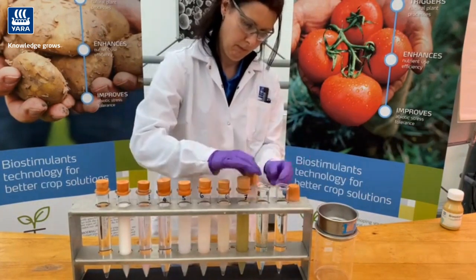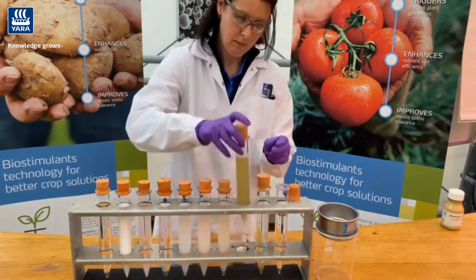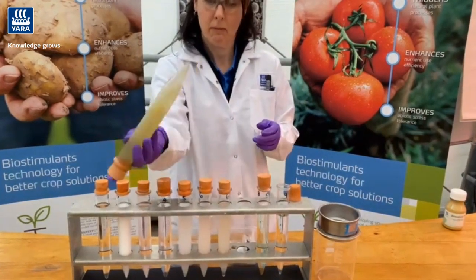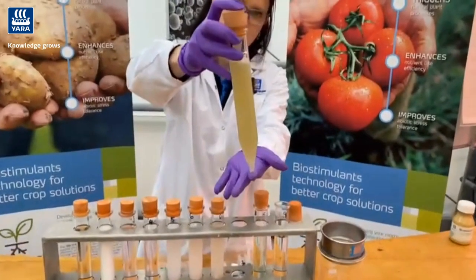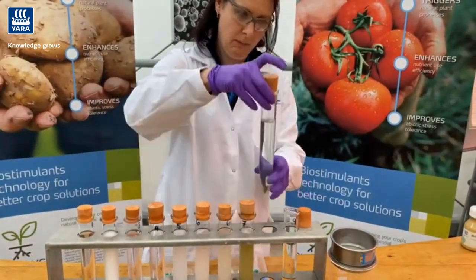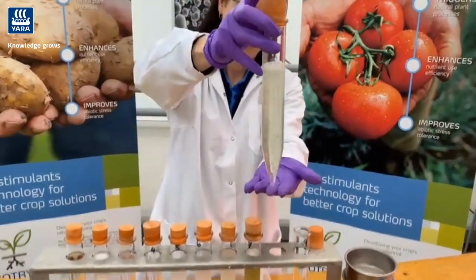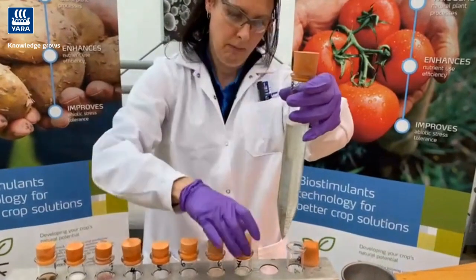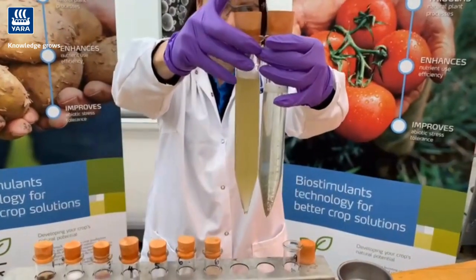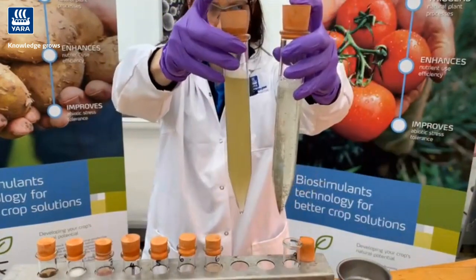And as you can clearly see, tube 7 is the correct mixing order. It's fully dissolved, then add in the liquid product. In tube number 8, we added in the liquid product first, and now the WG product will not dissolve. No matter what we do to that product, it just looks like a snow globe. So the importance of mixing order, which is why we have that now on the website.